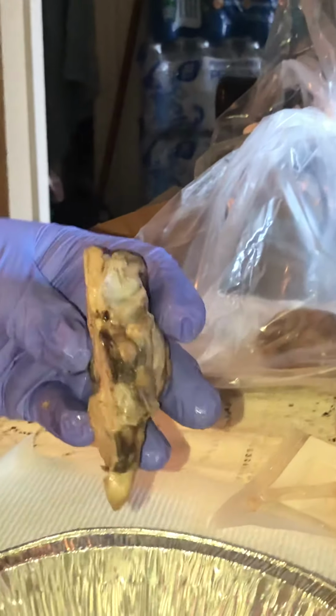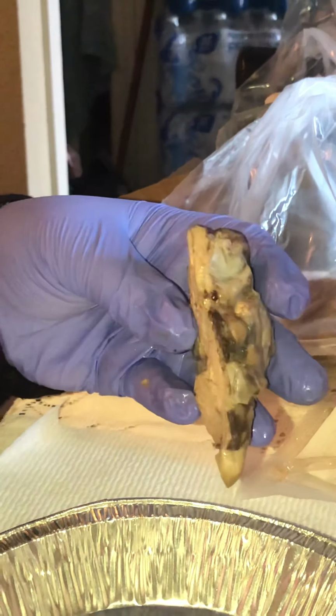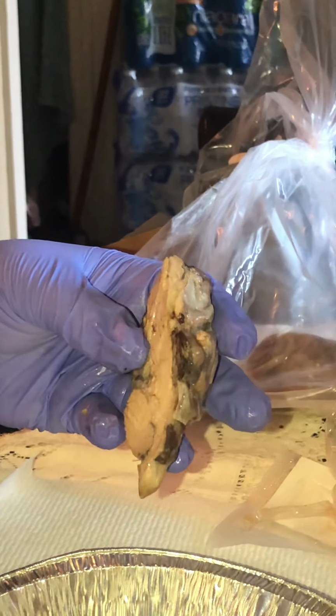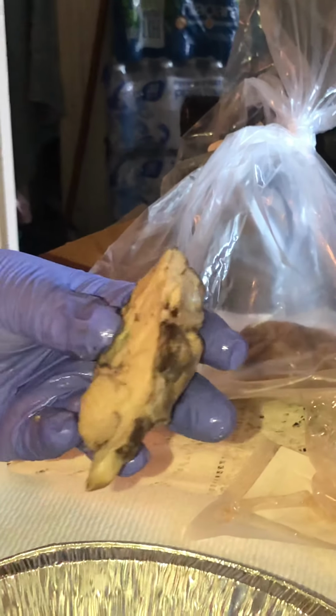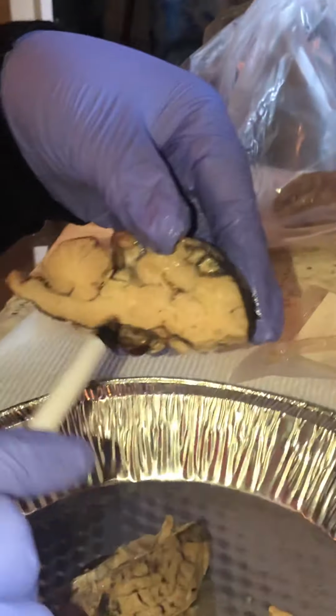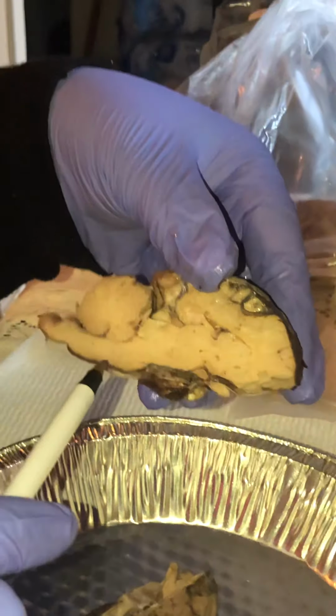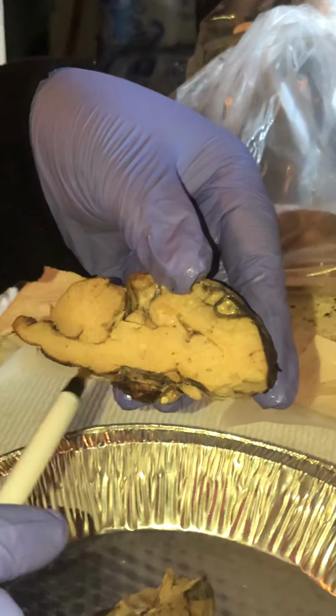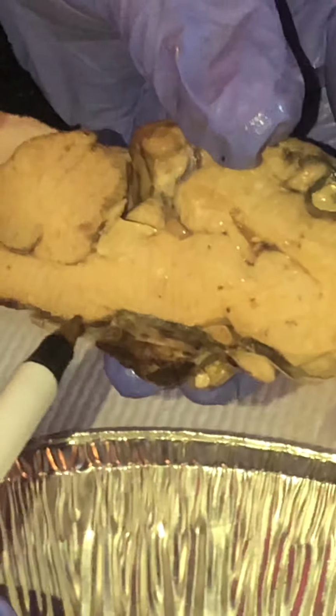So, let's see, what am I missing? So let's look at the hypothalamus, which I would say is right here.